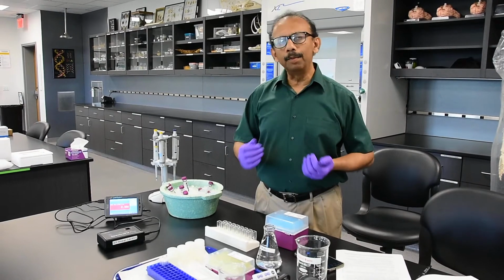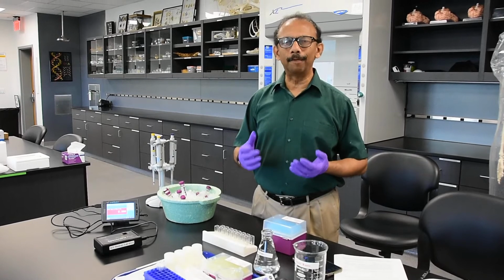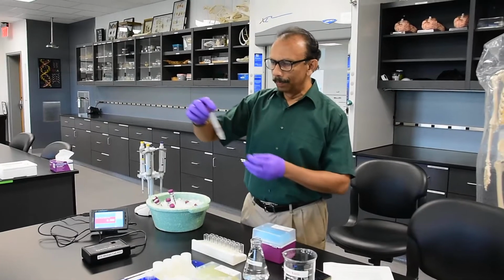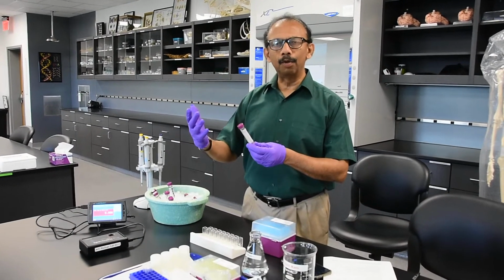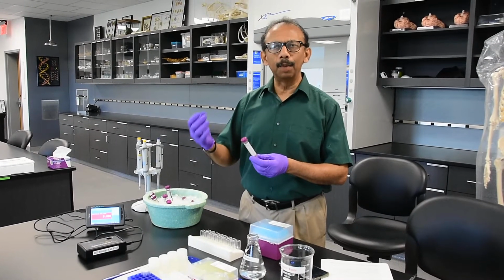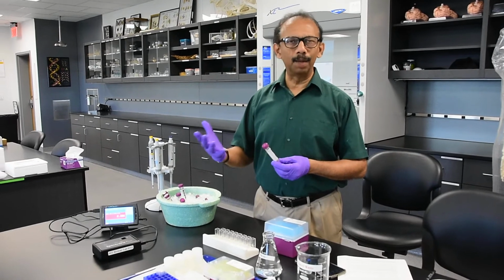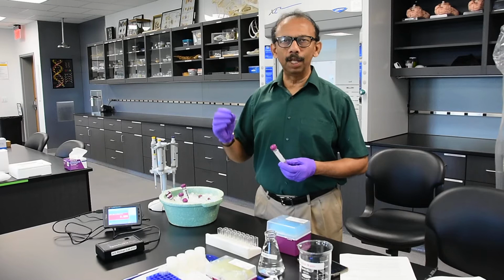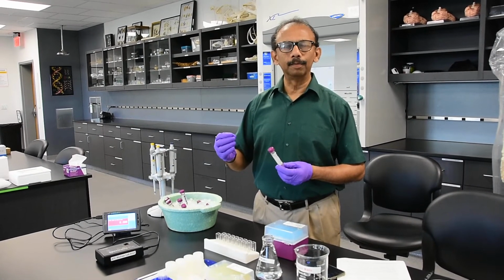Okay? The main objectives of the lab that we are doing today is to study the effect of concentration of the substrate, which is the glucose, on the activity of the enzyme, and then we are going to look at the effect of temperature on the activity of the enzyme, and then the effect of pH on the activity of the enzyme. So these are the main goals of this one. To start with, I'm going to do the effect of substrate concentrations on the enzyme activity.